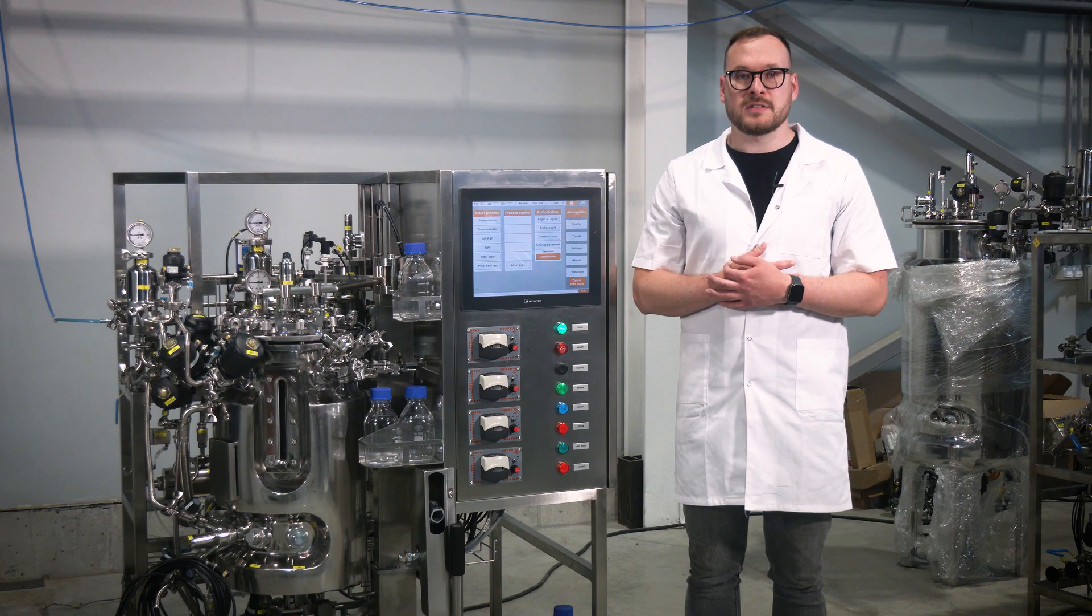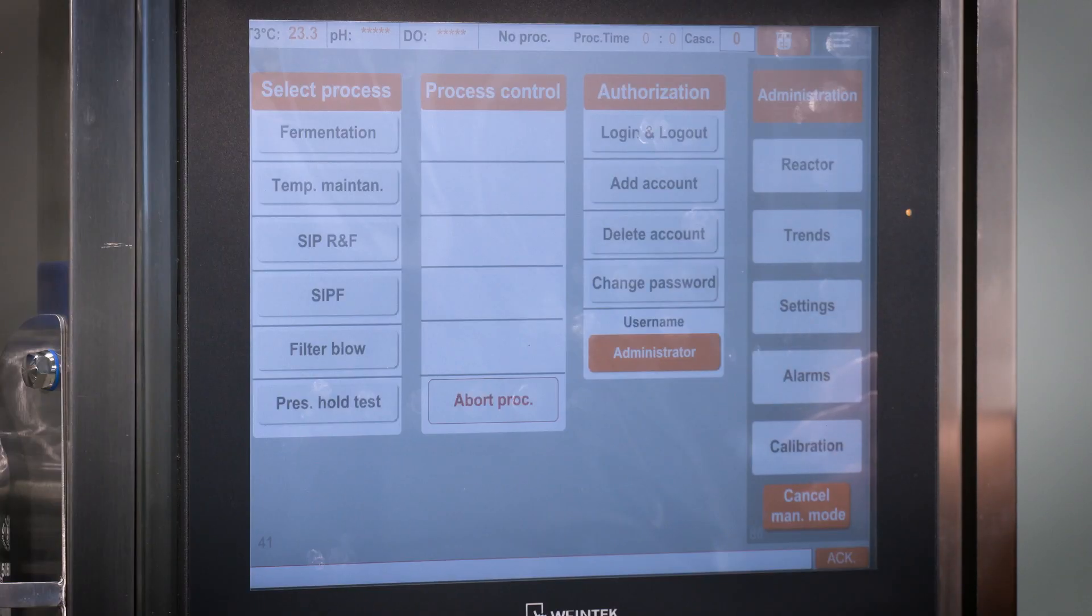Acknowledge active alarms, manage trends, start or stop automated processes. That includes fermentation, temperature maintenance, sterilization, etc.